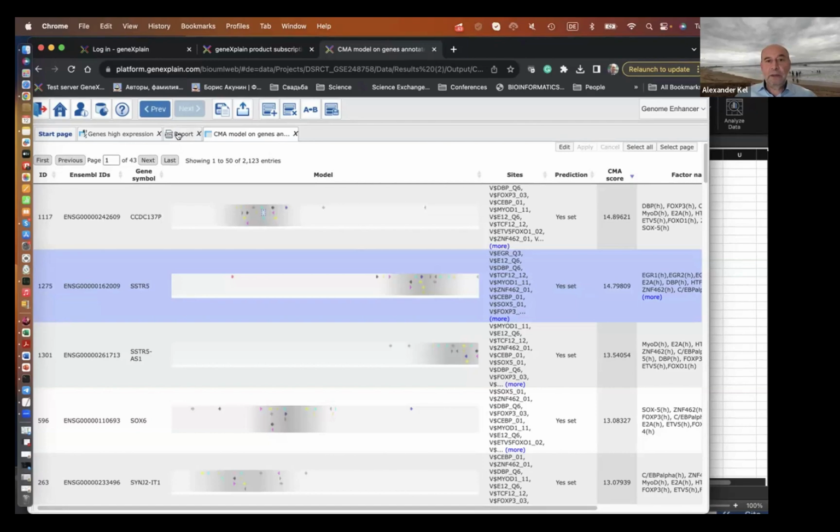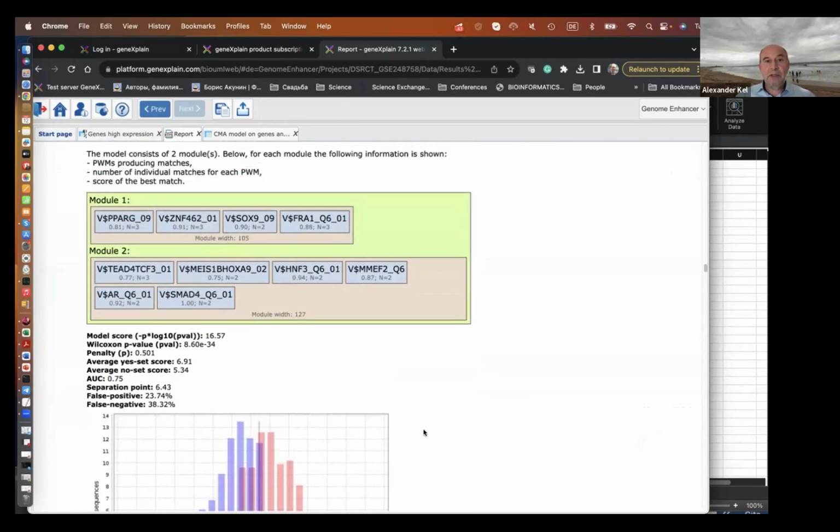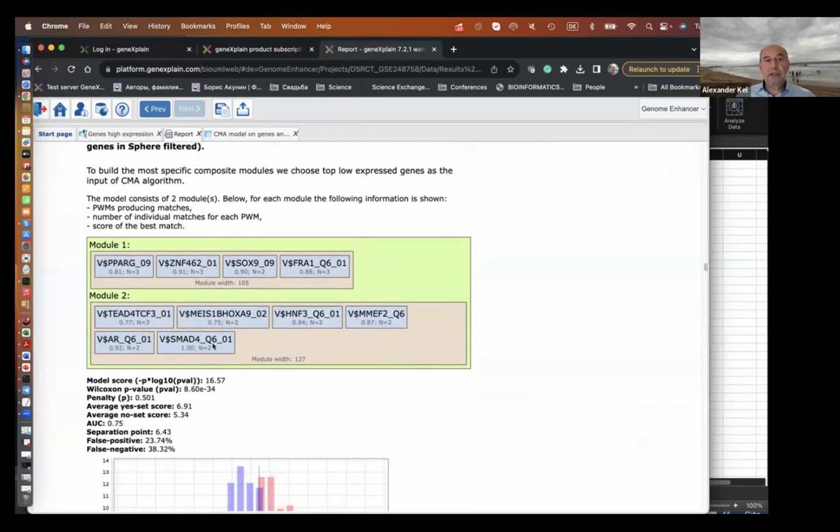All right, so this way we see how those found enriched motifs are found in the peaks. But we are going further. Actually, we want to look at the downregulated genes, and in the downregulated genes, we again see a set of other factors.